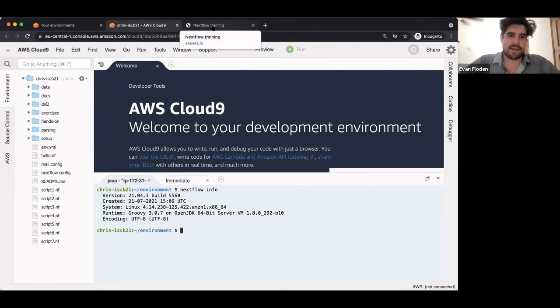So we're going to start off now by looking at a first Nextflow script, and then we can take a break after that. I think that's the schedule. And the first part of this, I don't want you to focus so much if you don't understand all of it, because it's not necessarily straightforward.